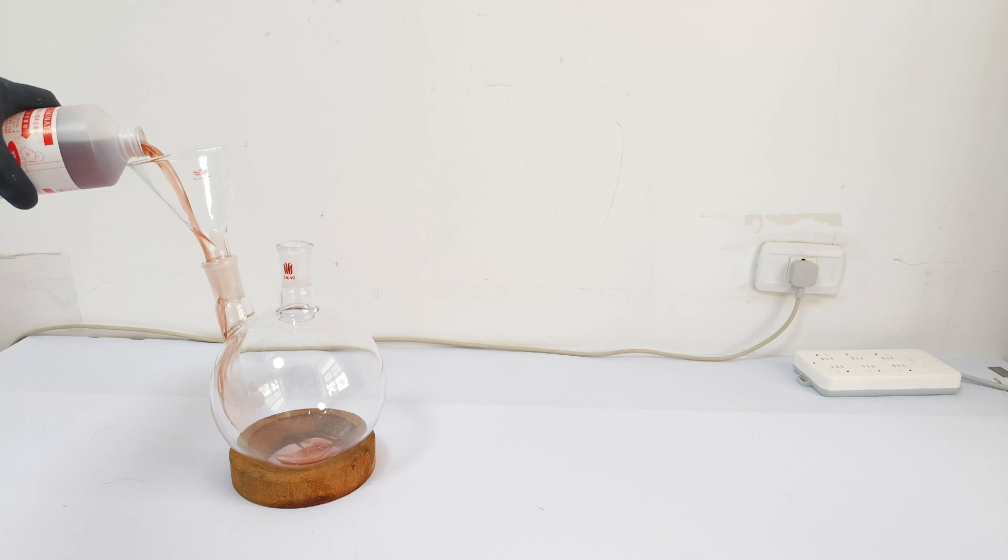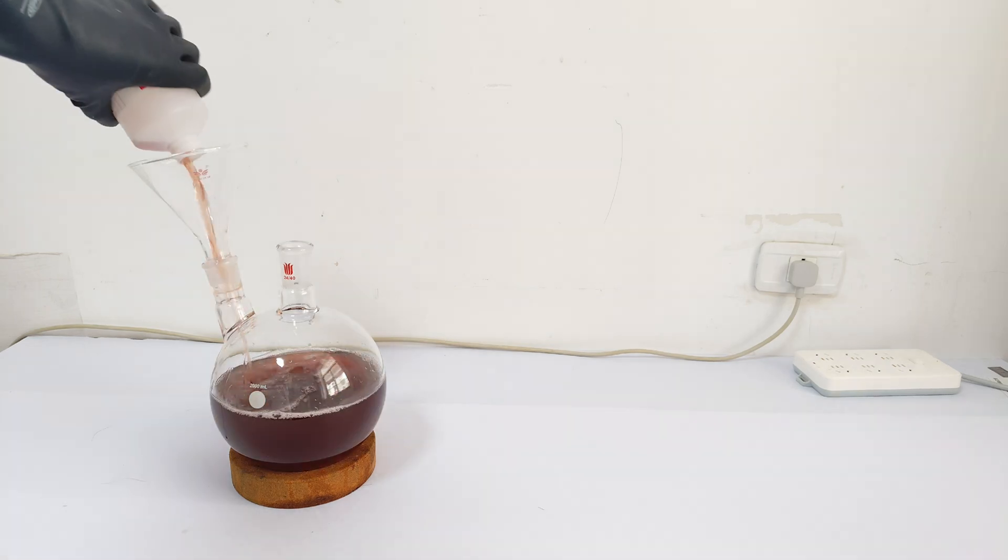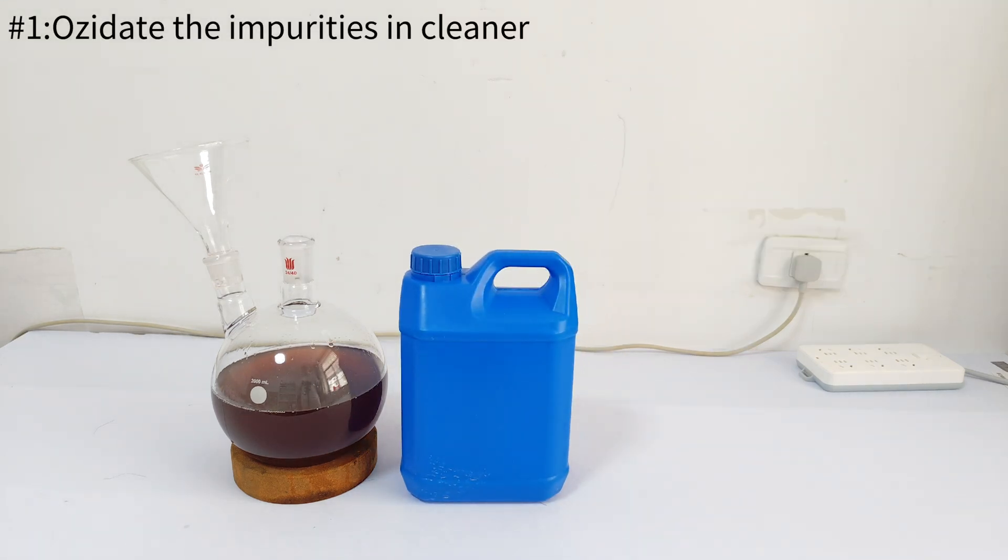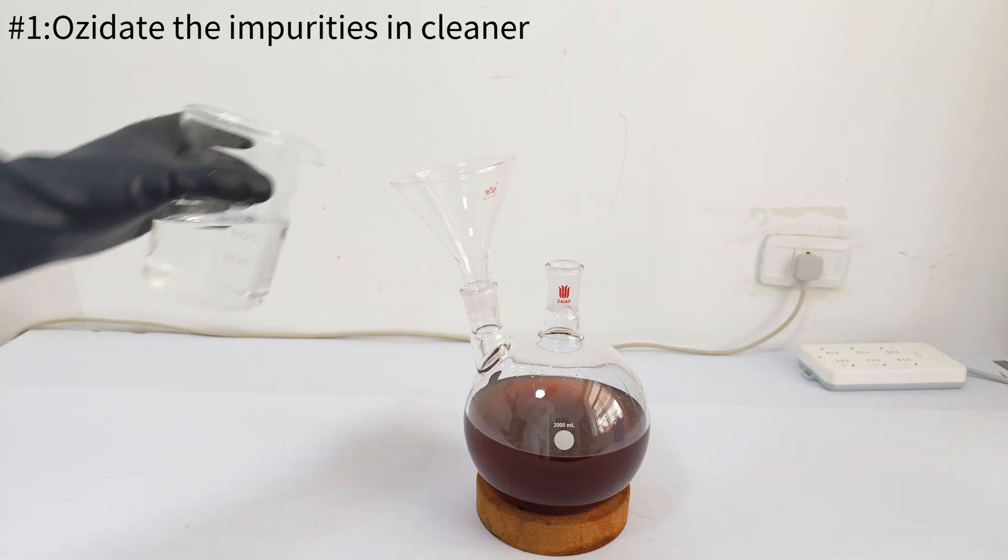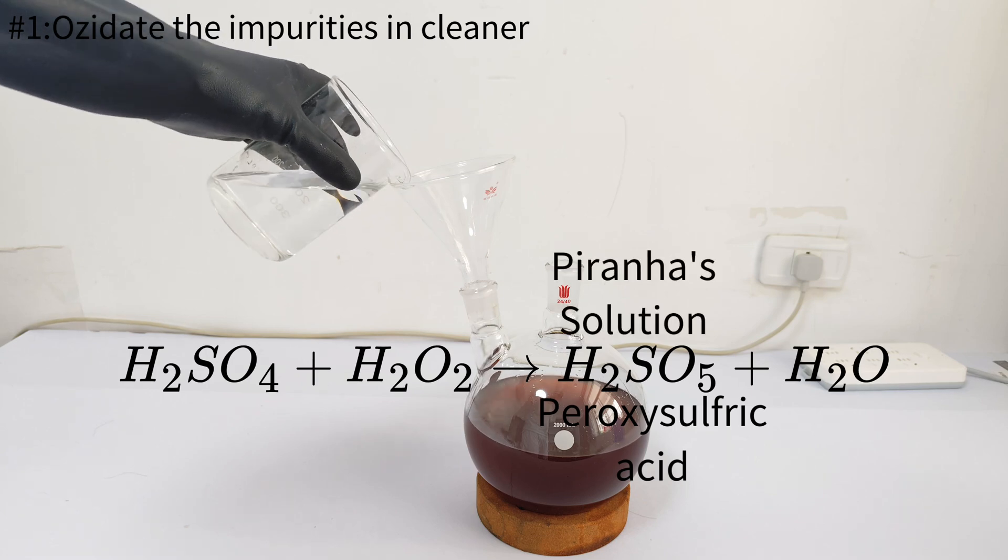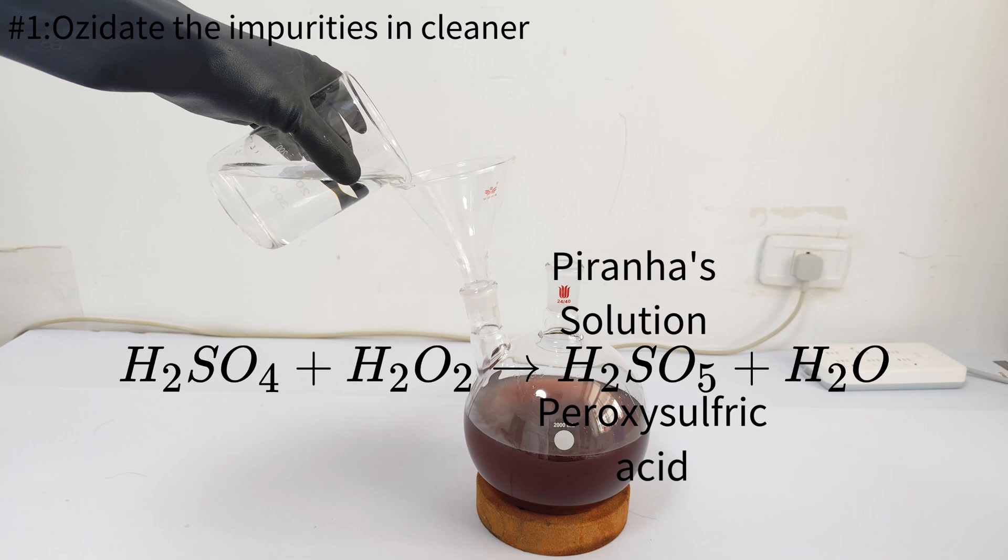So I just poured some drain cleaner into the big flask. The first thing I need to do is oxidize the organic impurities and SO2 in drain cleaner with some hydrogen peroxide, which can react with sulfuric acid and form peroxysulfuric acid solution, which is usually called piranha solution.